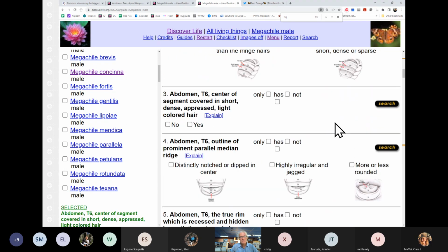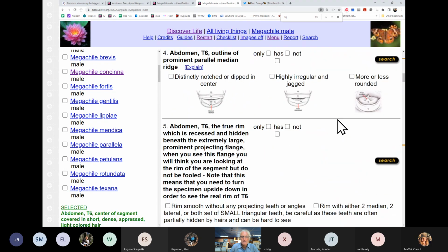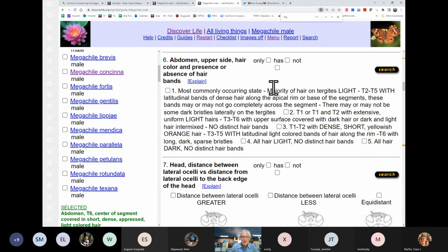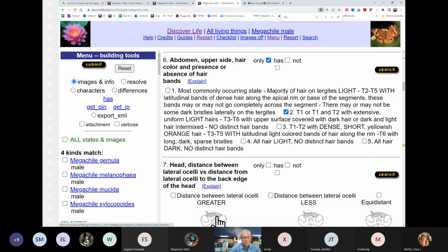So we're going, though, to now go to our abdomen, and here we go. So here we are with this. If we look at only what we're looking at, it's a small list of species. You'll recognize these as the species, or most of the species, that have black scopal hairs. They also have different kinds in the females, and different kinds of hair patterns in the males.